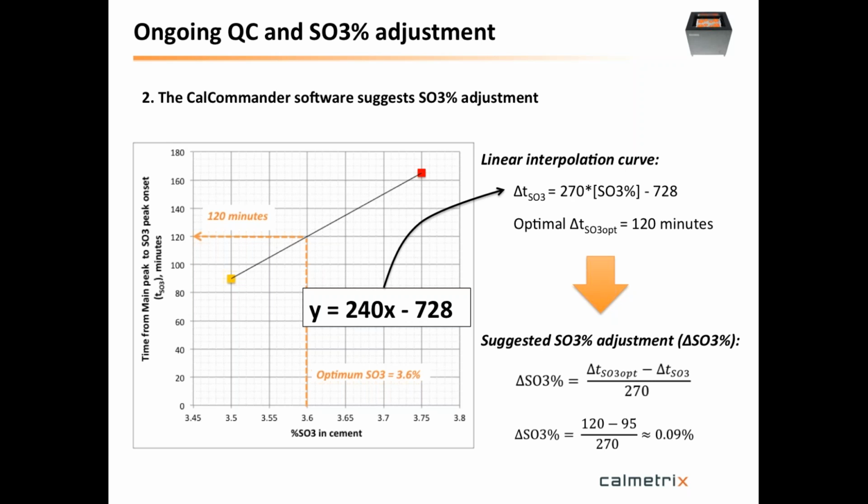Now, of course, those who have used calorimetry will say, well, in the real world, it's not exactly that easy because I actually have to precondition the water. If I use a certain water amount for the preparation of my sample and this water is not at the exact same temperature as the calorimeter, I'll get junk results in the beginning of the curve, which is true. So conditioning the water means I have to put water at least 2 hours into the calorimeter before I start, then come back and prepare the sample, it takes logistics. And if you don't have the same operator every day in the cement plant, there's also a point to be made that you could have some variability because different operators mix differently, they have different procedures, so it's not completely perfect.